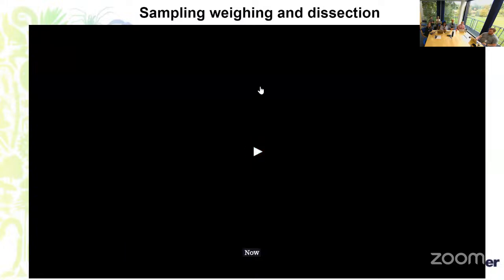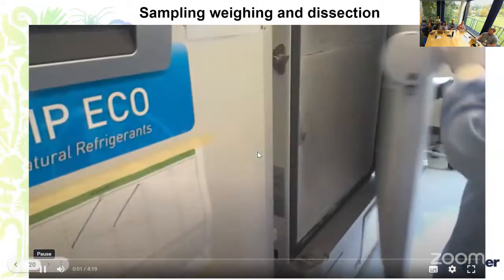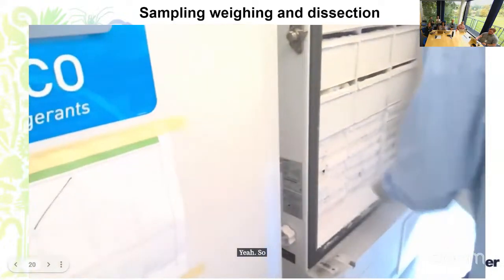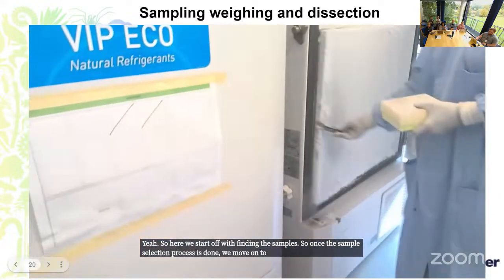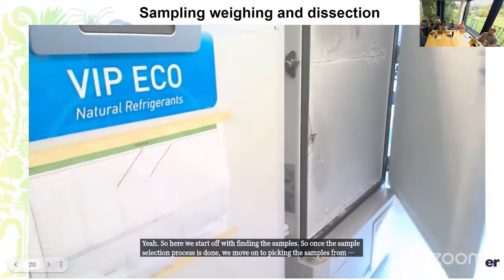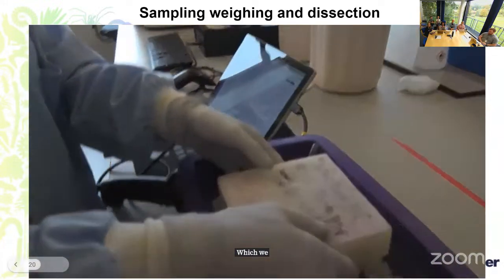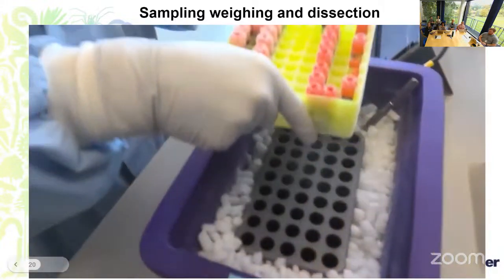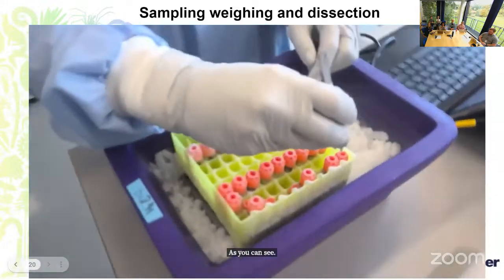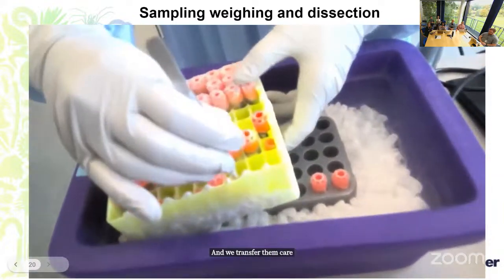Now I'll play a video of the preparation process within our core lab. So here we start off with finding the samples. Once the sample selection process is done, we move on to picking the samples from -70 freezers, and then we transfer them to cold racks, which we take to the sample prepping area. As you can see, all the samples are in uniquely barcoded FluidX tubes, and we transfer them carefully into cold racks, which are placed on dry ice.